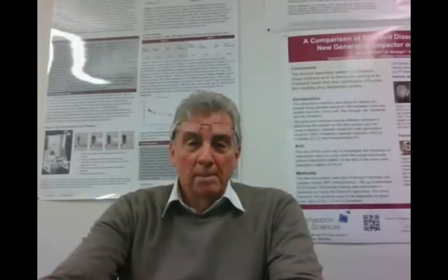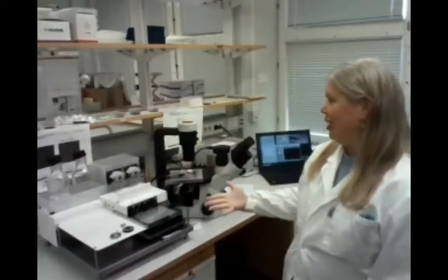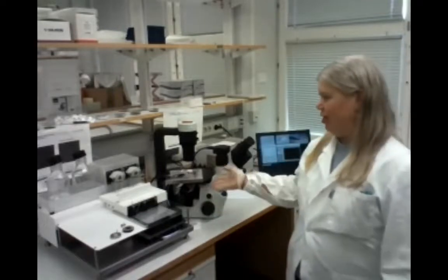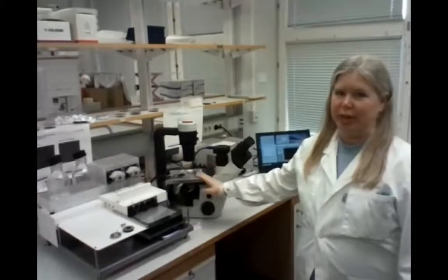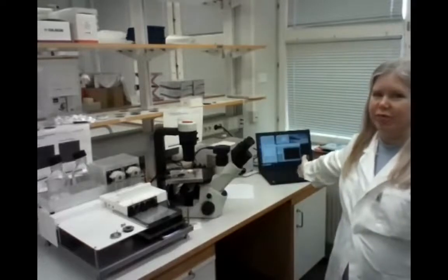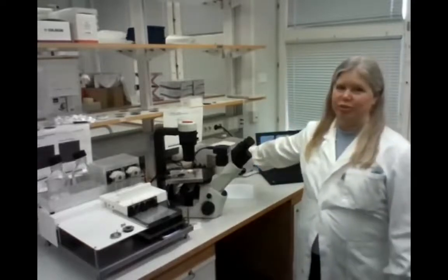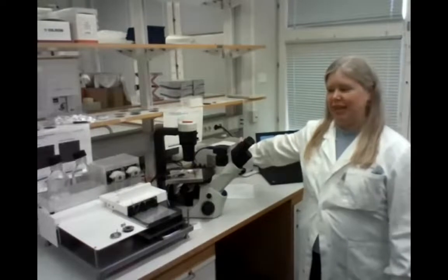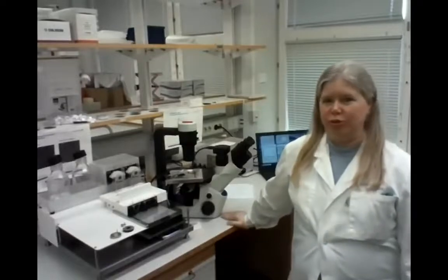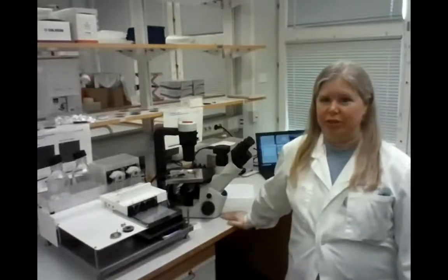Please, Maria. Yes, thank you. Now I'm here again from the lab this time. So here we have the setup of Dissolvit. We have here where the dissolution takes place on the microscope. We have the pumps, the fraction collector, the computer that steers everything, and the control box that has the electricity within it, and also the microscope, if I didn't mention that. So I will take you through a typical experiment here.